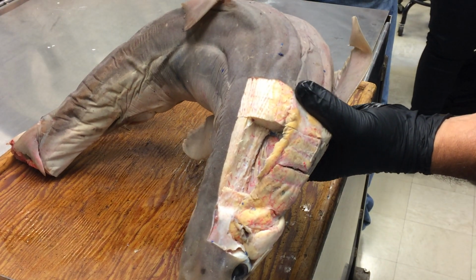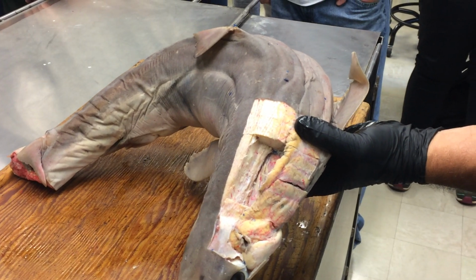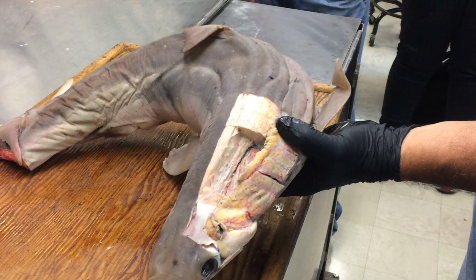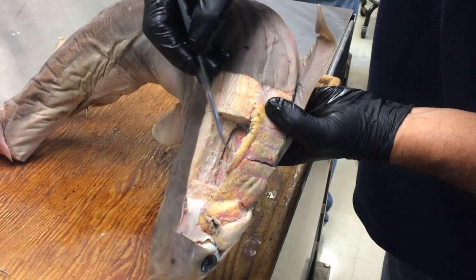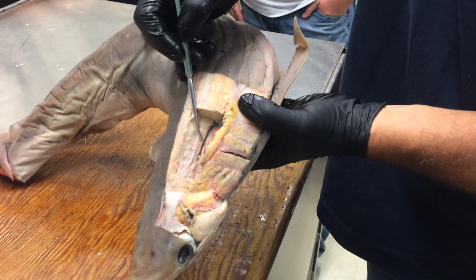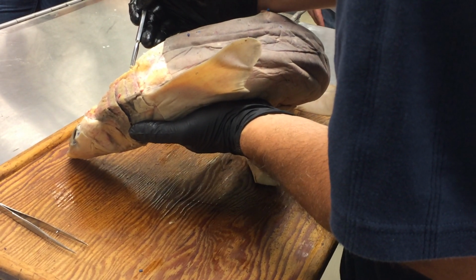Do you remember what cartilage is the top piece of each branchial arch? Remember there's 5 from top to bottom. It starts with a P. The pharyngobranchials, yeah. The pharyngobranchials, depending on who you talk to, are those top pieces. And they kind of angle back. So this is a pharyngobranchial. This is another one. You can see these muscles running across between one pharyngobranchial and the next. And those are the dorsal interarcuals. So here's the pharyngobranchials running along, and those are the muscles. There and there, the dorsal interarcual muscles.